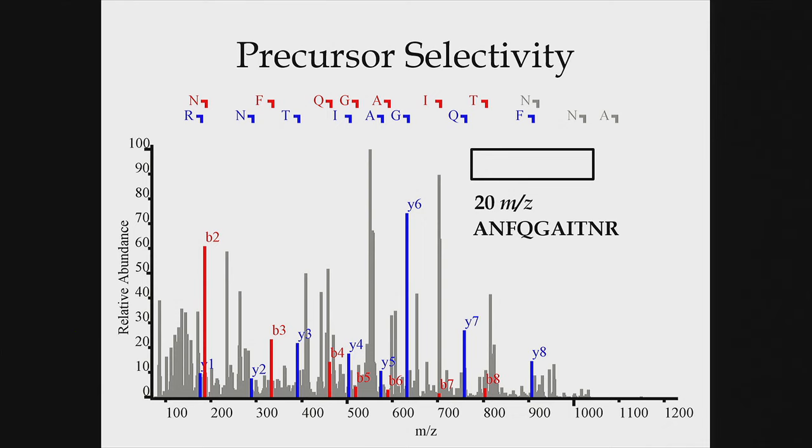This is what underlies everything that I've been saying, and it's been consistent throughout the course. Bruno has this great plot showing the different precursor widths and how many transitions have interference, and you see improvements going down from 20 to 10 to 5 to 2. So in my mind, this is where we improve in DIA moving forward in the future, to have better precursor selectivity as we move on. And I guess the converse statement would be that it's the greatest limiting factor currently.